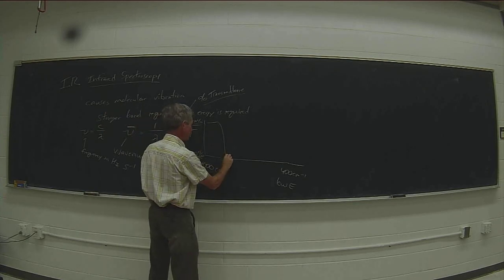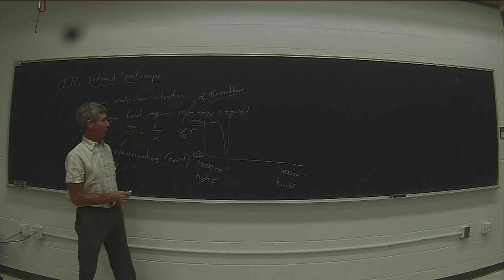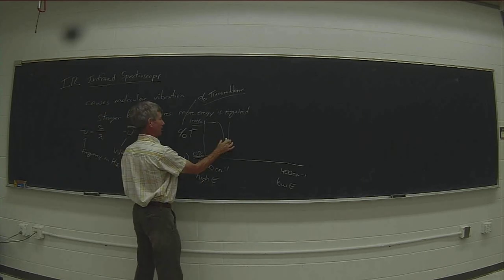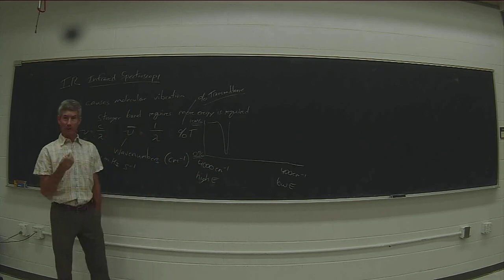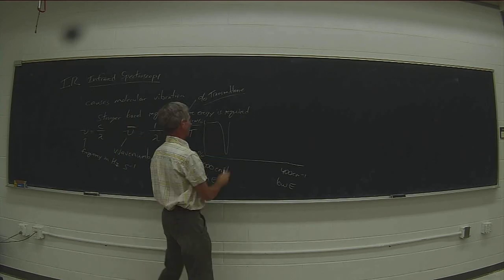And we'll see a peak where a large amount of light is absorbed. It tells us we've got a bond that has the strength that can only be vibrated by this high energy peak.